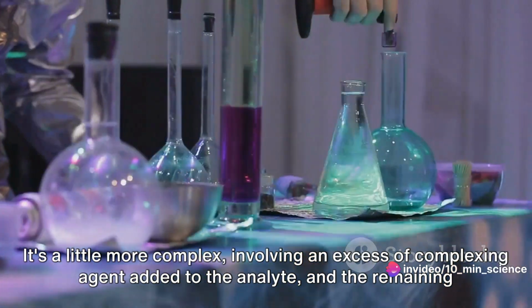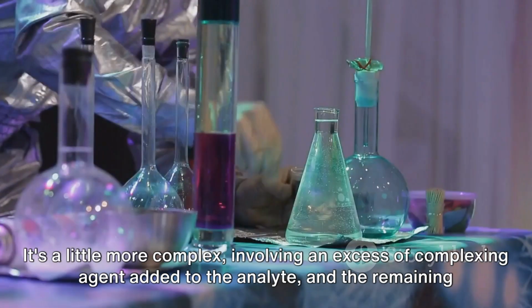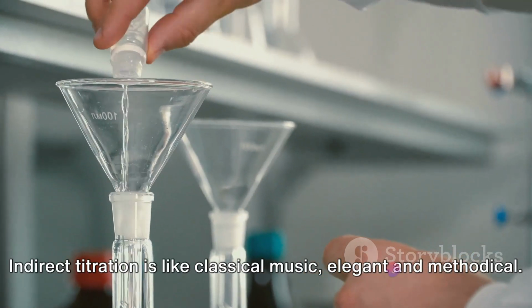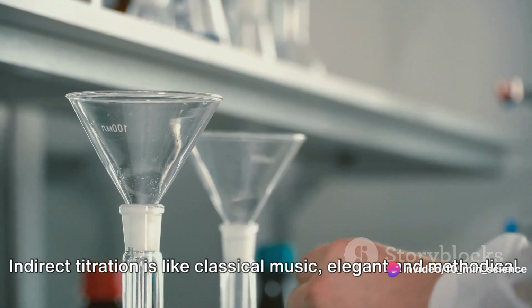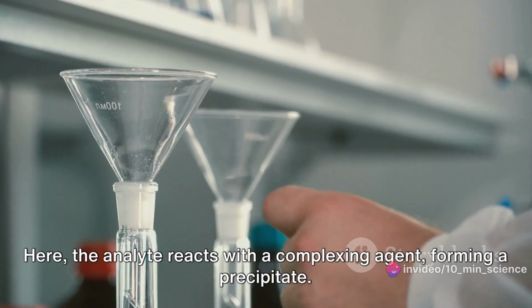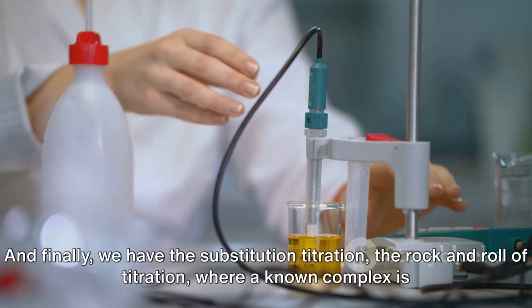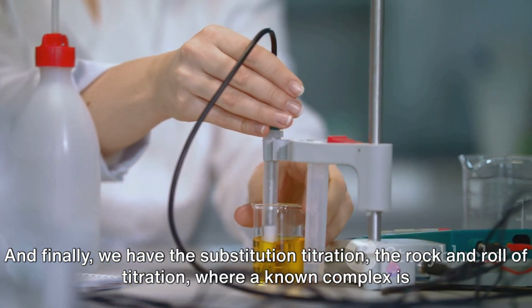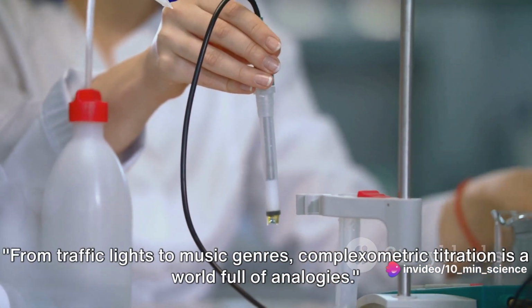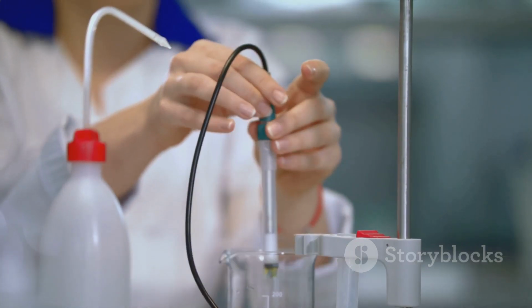On the other hand, back titration is the jazz of the complexometric world. It's a little more complex, involving an excess of complexing agent added to the analyte, and the remaining complexing agent is then titrated. Indirect titration is like classical music, elegant and methodical. Here, the analyte reacts with a complexing agent, forming a precipitate. The precipitate is then dissolved and titrated. And finally, we have the substitution titration, the rock and roll of titration, where a known complex is substituted by another ligand. From traffic lights to music genres, complexometric titration is a world full of analogies.